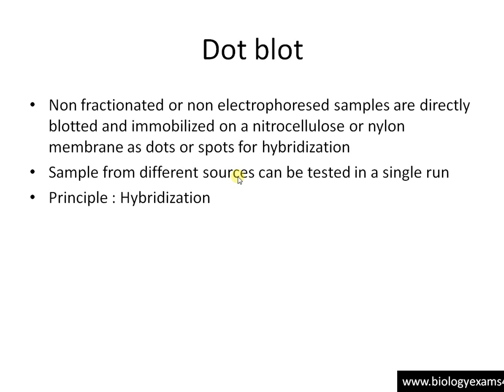The principle is hybridization. Here also we are adding a probe, and we'll be washing out unbound probes, and the probes are radio-labeled. If the DNA is present, then the probe will bind to the DNA and we'll be getting some signals.